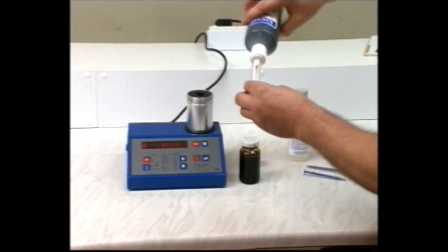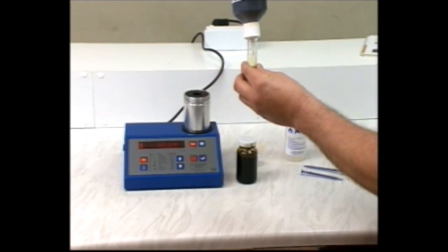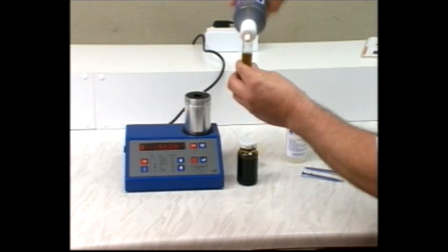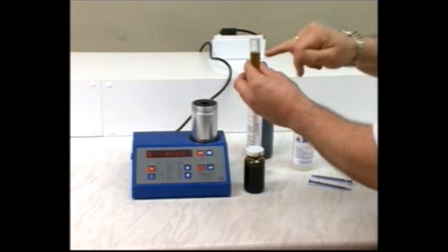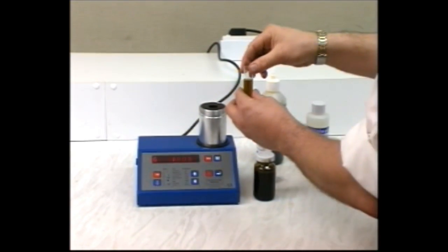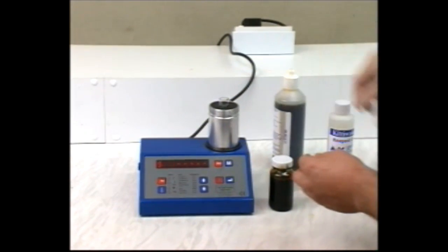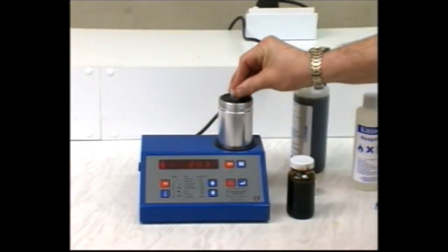Place the cell on the unit and unscrew the end cap. Fill the TAN tube to the fill line with reagent D and place it gently in the cell. Press zero on the unit.